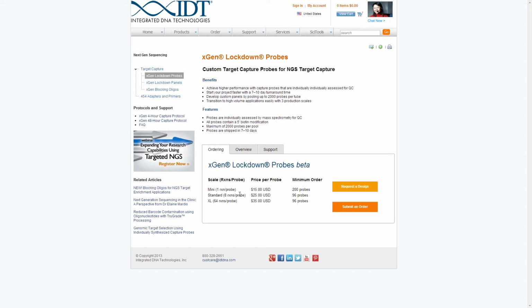If you're trying just to sequence longer, but the fragment size is small, you just tile against the entire gene, and that's not really an issue. But if you're asking about whether to capture a very large fragment, so a fragment that's 5 kb or longer, that's a different issue because of the thermodynamics of a probe capturing a region that large.